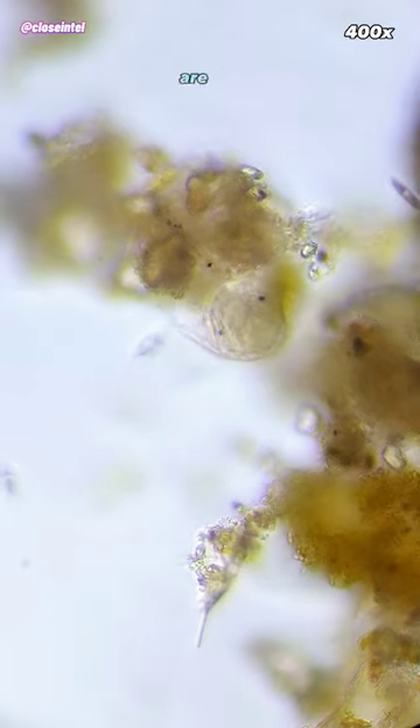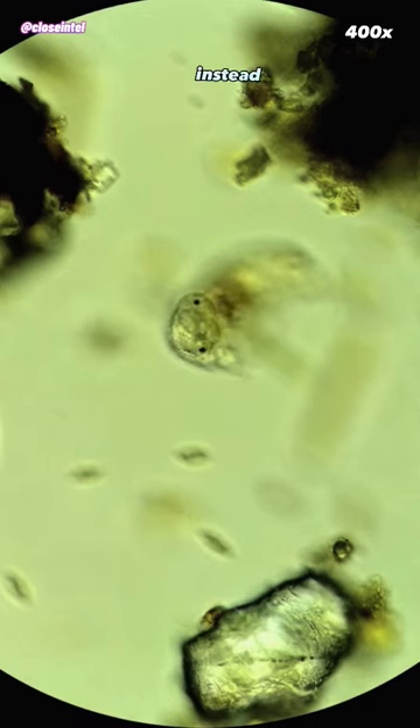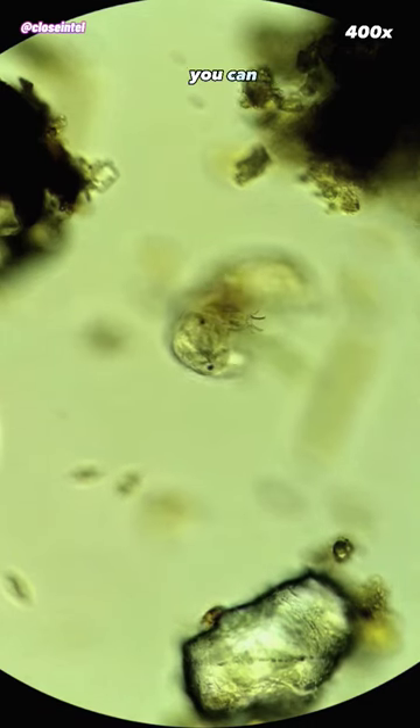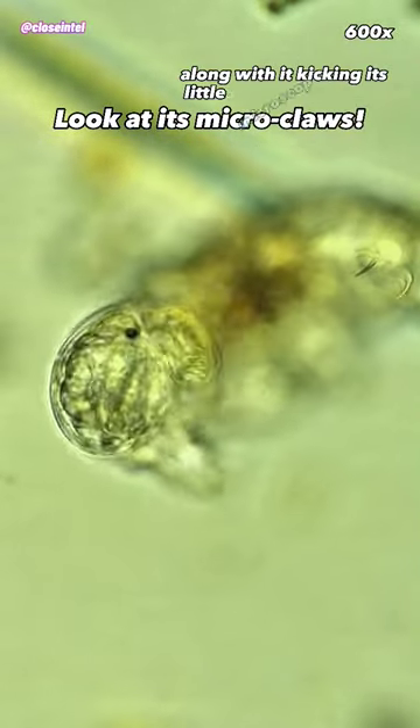This is because tardigrades are born with every cell they'll ever have, and over time these cells will grow bigger instead of new ones being created. You can also see its two black eye spots on the top of its head, along with it kicking its little microscopic claws.